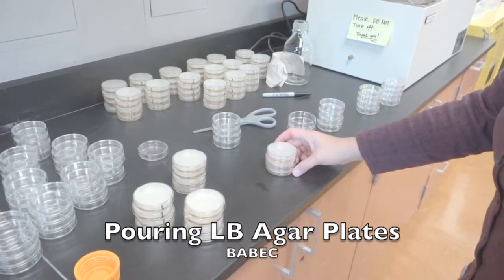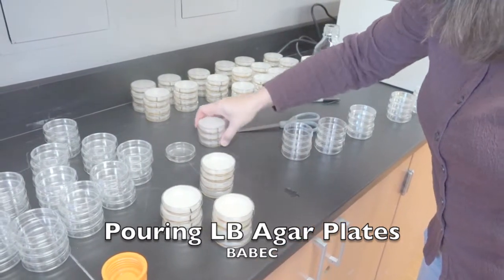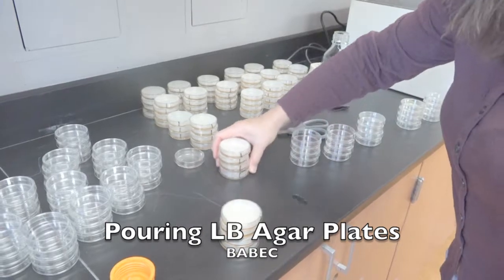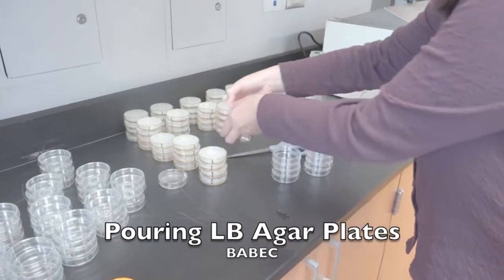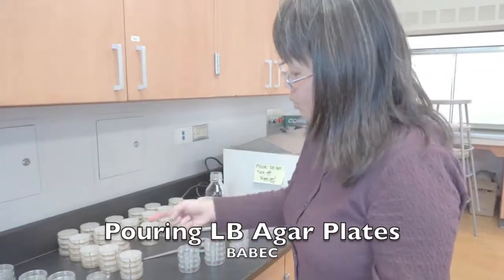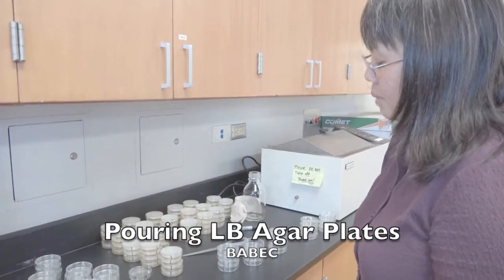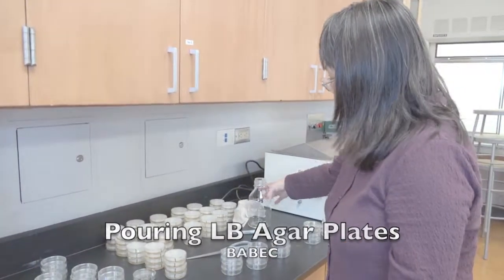Once these plates are poured, you can slowly set them aside. Notice how slowly I'm pushing it with my other dishes — you don't want to splash any onto the lid of your petri dish. Now it's just going to sit at this location for one to two days until it dries out a bit, because there's a lot of condensation on top of these petri dishes, and that's also not a good thing. Next up, we will be pouring our LB agar and adding ampicillin to it.